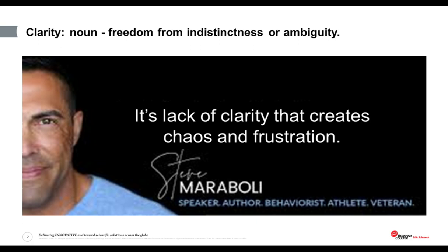So I wanted to share this quote with you today because sometimes cleanroom routine environmental monitoring programs can seem very burdensome and very manual, and the sheer volume of manual sampling leading to a high volume of data to be managed. These sheer volumes of data can be confusing and can lead to a lack of clarity, sometimes unfortunately resulting in data integrity errors.